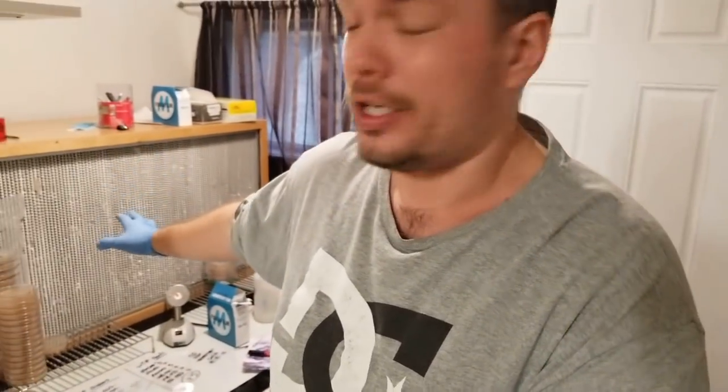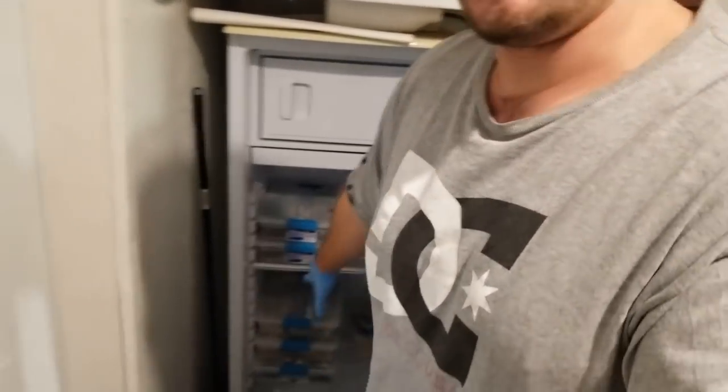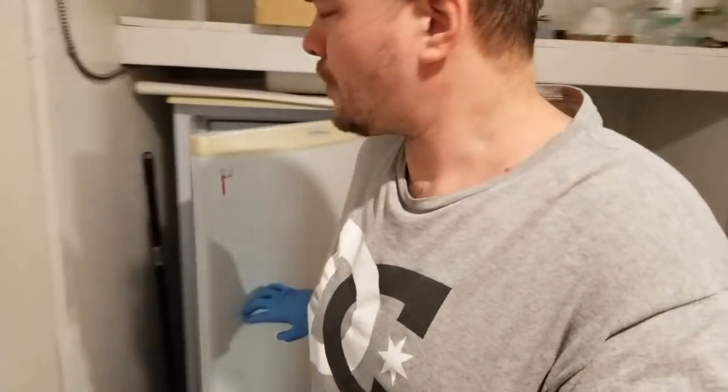A lot of people think you need real sterile conditions. That's not really true. What's really important is that you have a really good flow hood and you work in front of that and you have sterile procedure. We keep all of our cultures in the fridge. We have all of our test tube masters just in there. We have about 73 strains right now and we grow maybe about 12 of them every year.